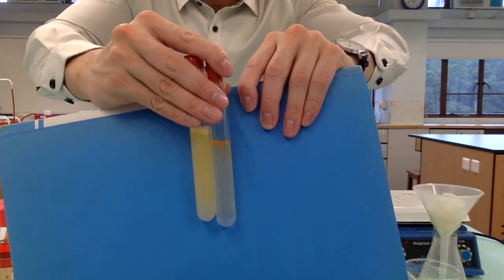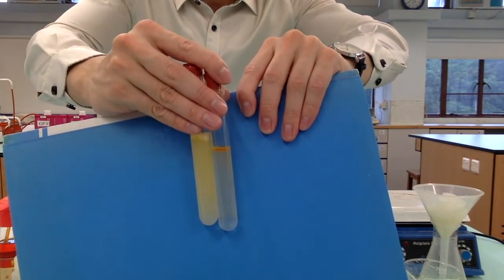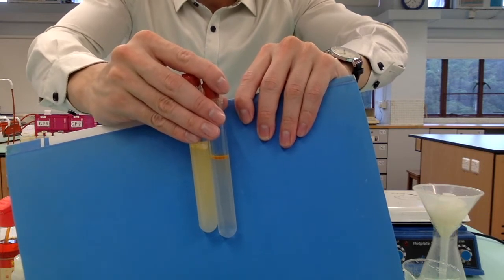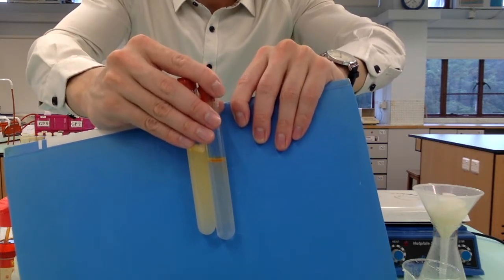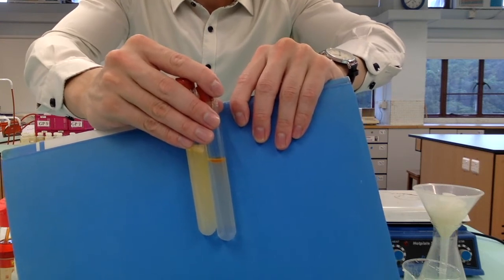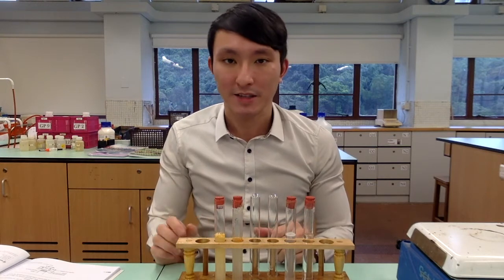Now, you can see that there is only one layer of liquid, so this enables easy washing of the oily dirt, as we can simply pour away the water, then we are able to erase or clean all the oily dirt. So this result shows the cleaning property of soap. So this concludes the experiment, and that's the end of the video.